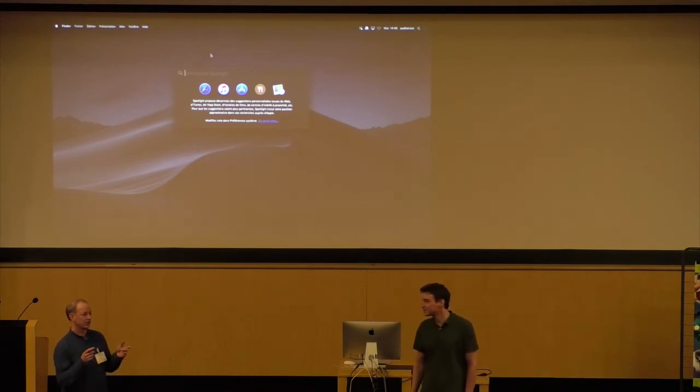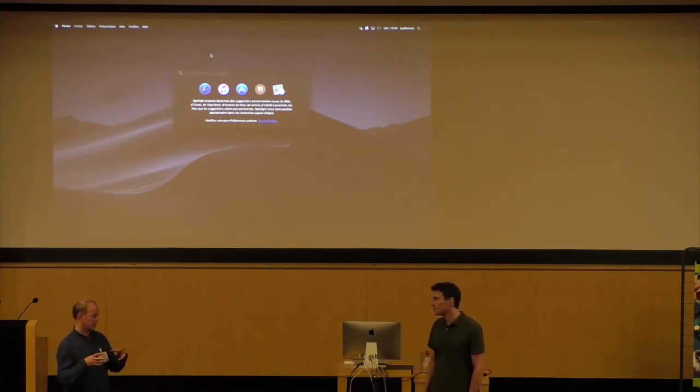Because what you mentioned, that you add a bit of water at the end: if it's a multi-subunit complex and your salt concentration is rising, then it may be too late to add water. It's already sensitive. So that can be quite delicate. Is there a way to avoid that completely?